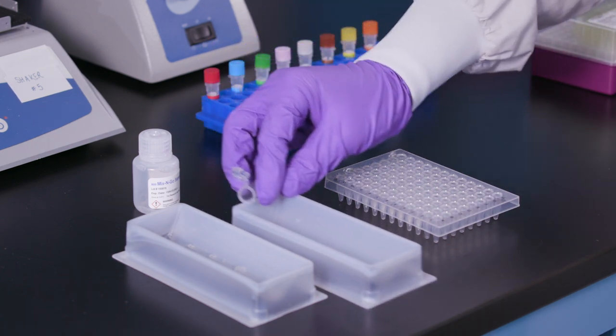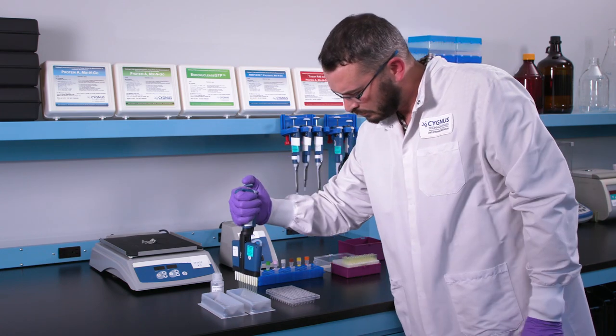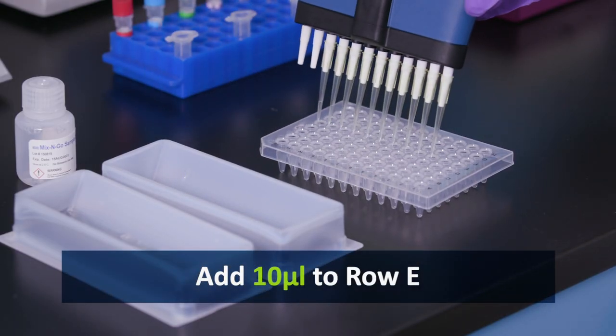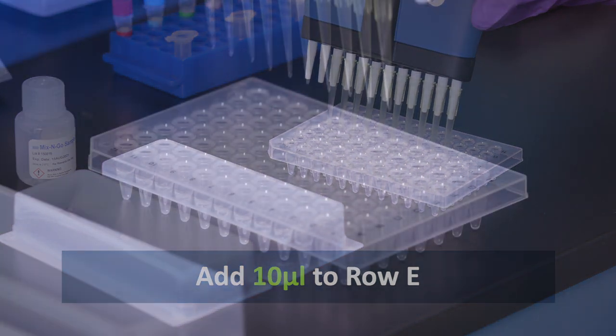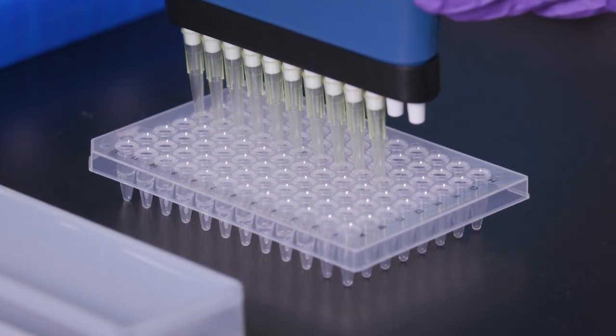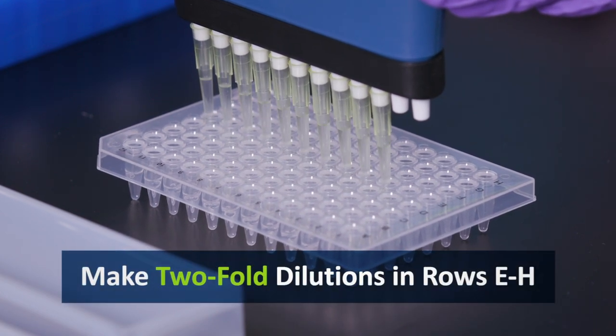When finished, add 10 microliters of the spike solution to all samples in row E. Then, make two-fold dilutions in rows E through H.